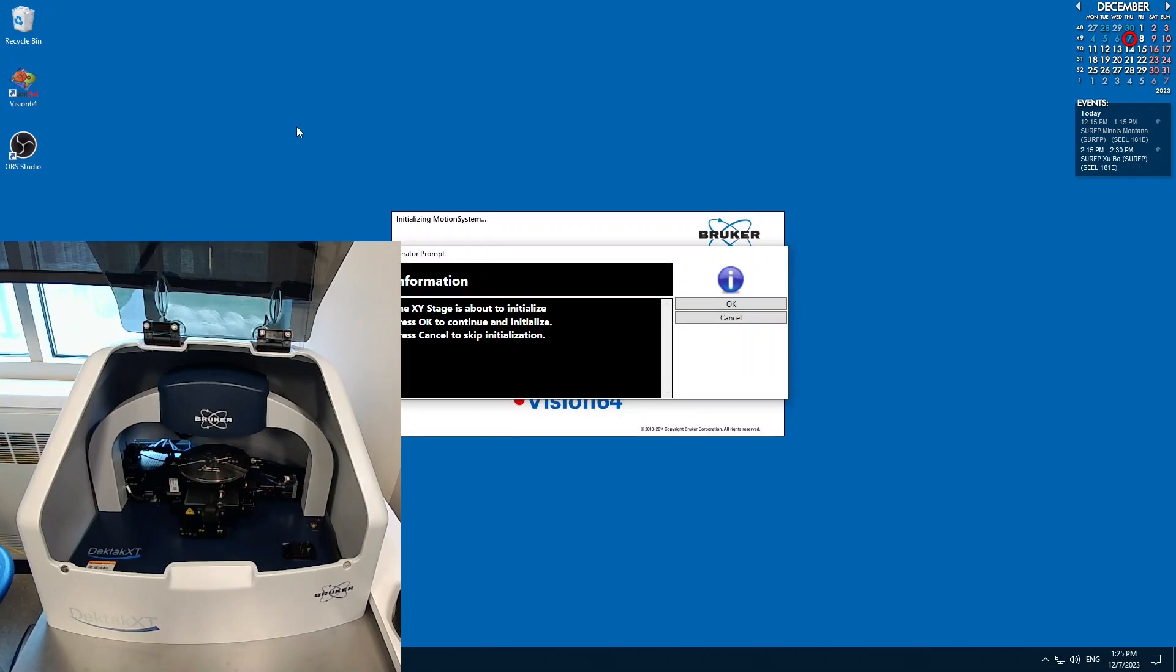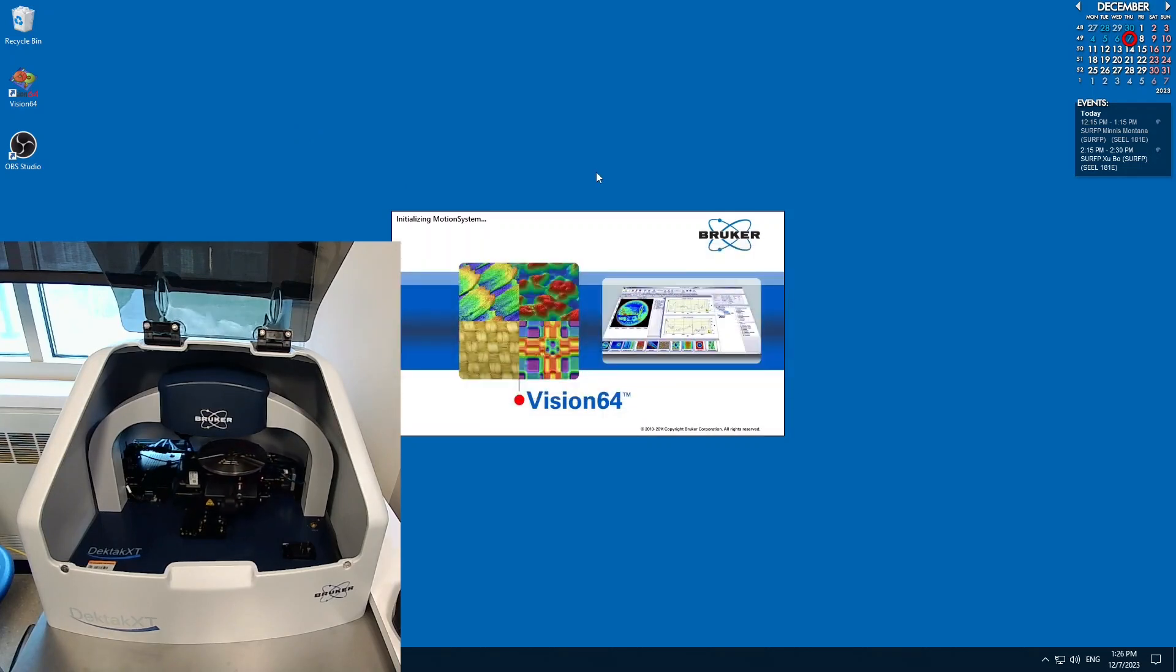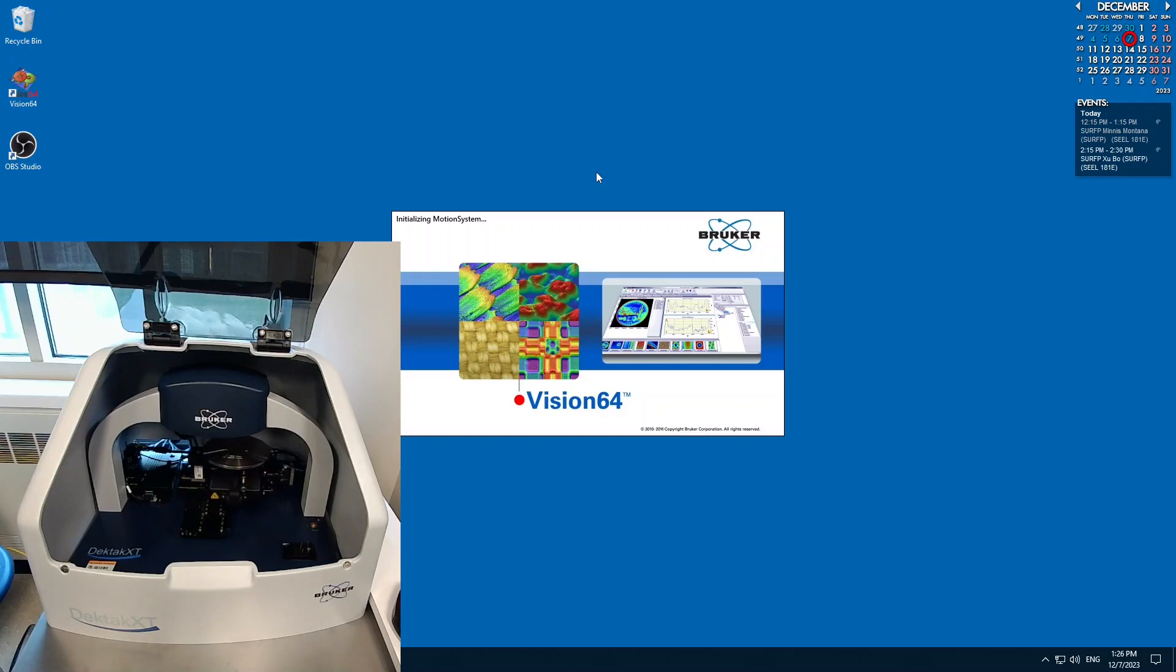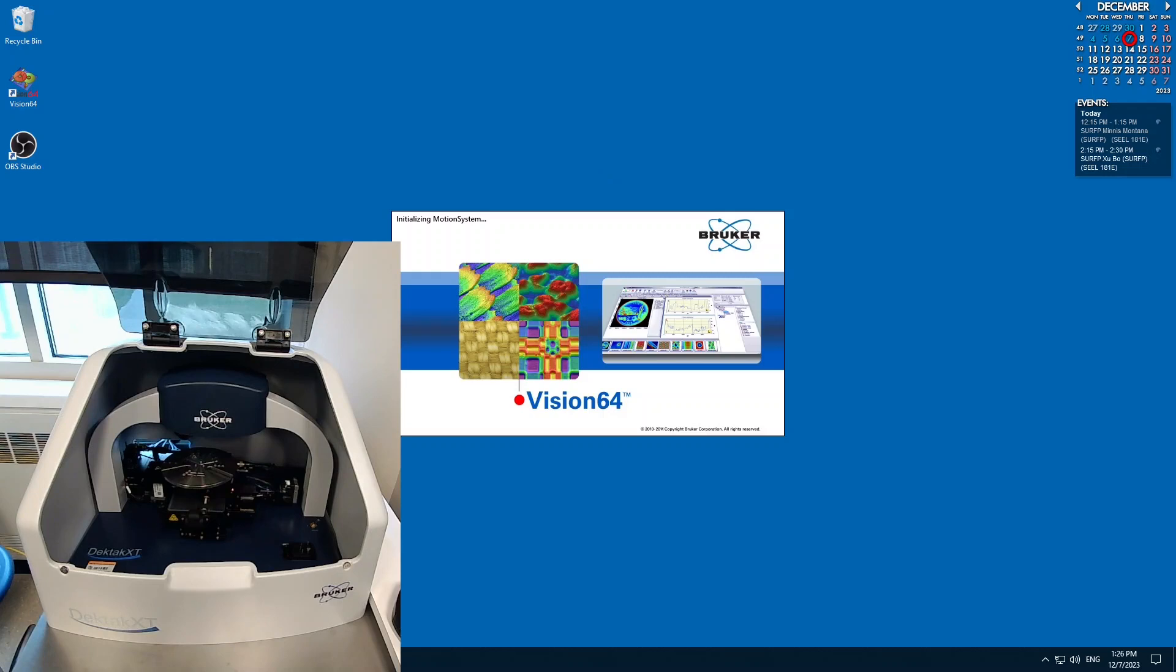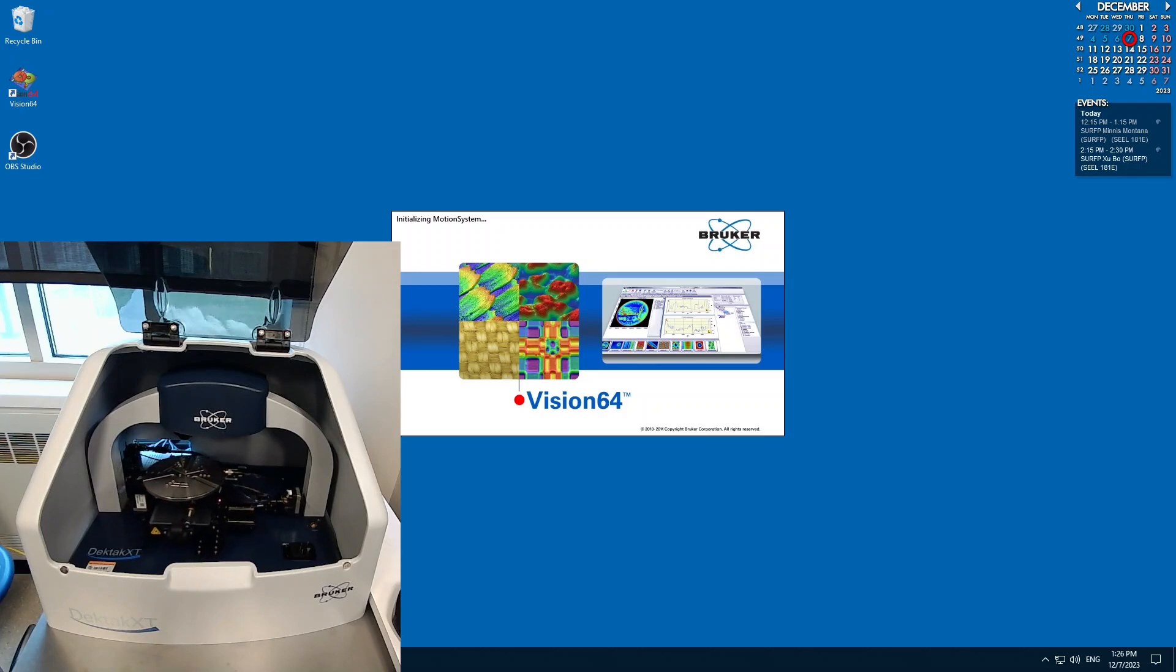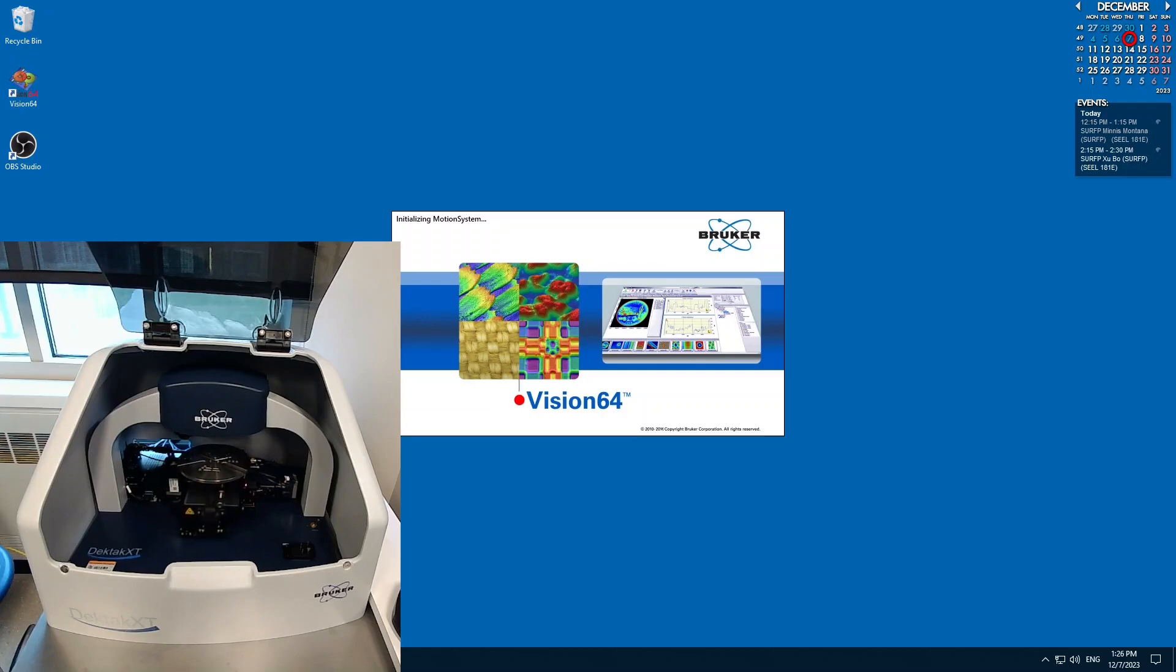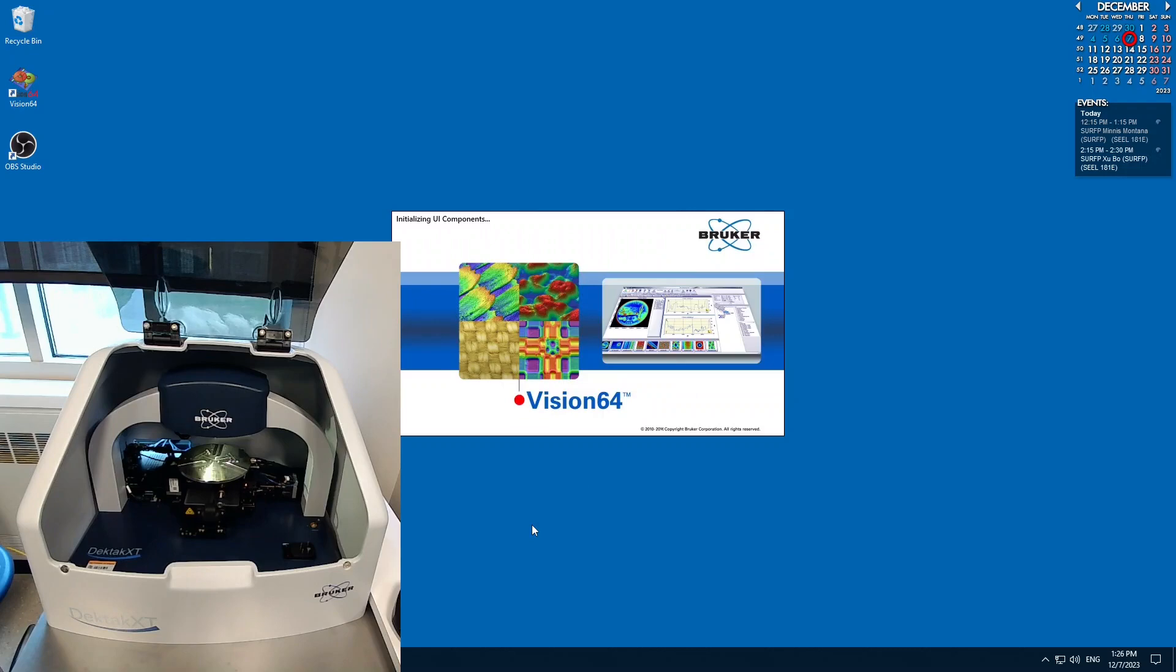Make sure that there's nothing on the stage that could crash into the tip before you initialize the stage. This step will initialize the XY of the stage. This next step will initialize the theta or the rotation of the stage.